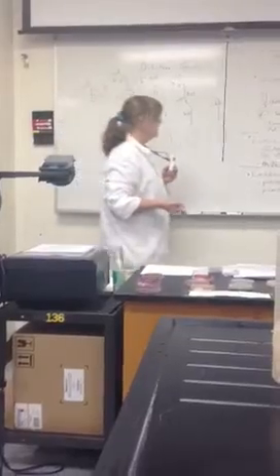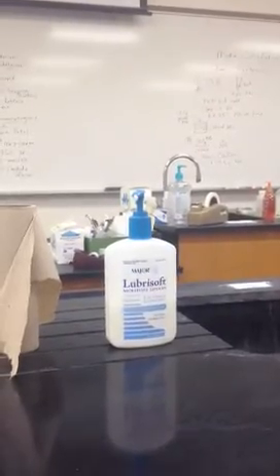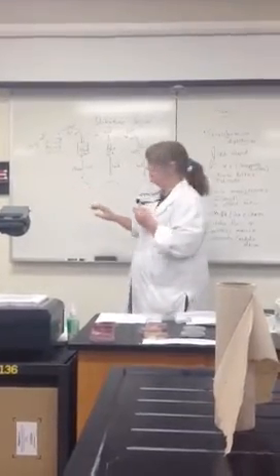Now, first I want to say, what is the goal? We run this dilution series, we count the colonies, and I've had people ask, well, why do we do it? Count the bacteria. The number of organisms per mil in the original sample. That's why we do this. That's why we go through all this series of patterns.